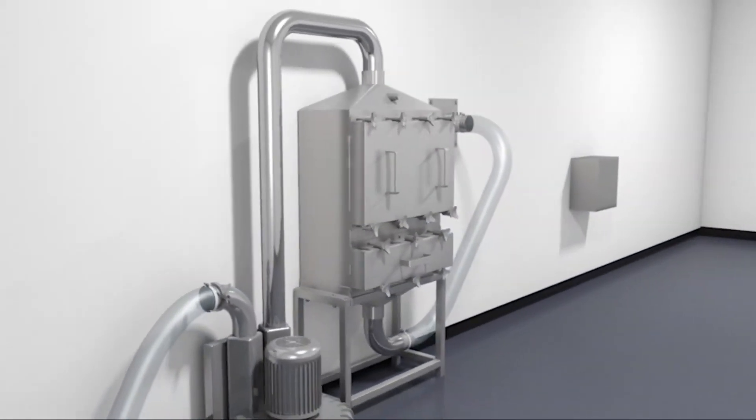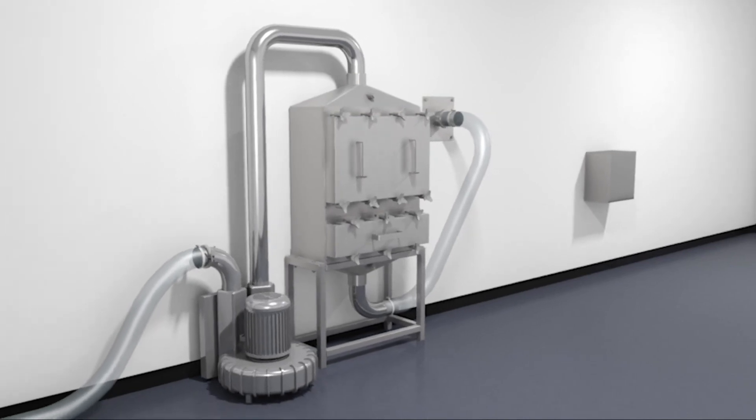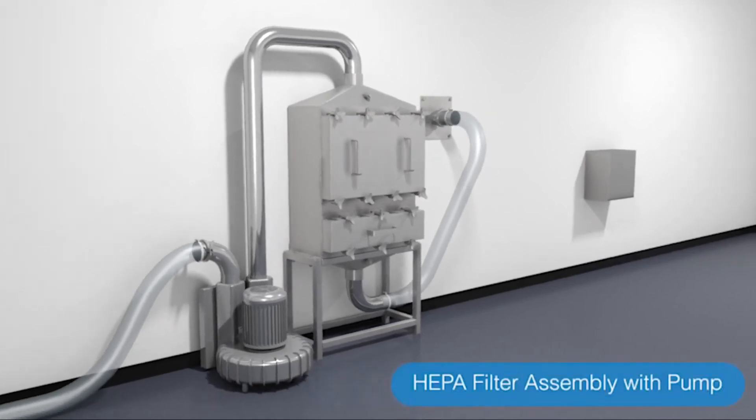Where an LEV line does not exist, Hanningfield can supply a dedicated vacuum pump with optional HEPA filter for guaranteed capture of any carryover.